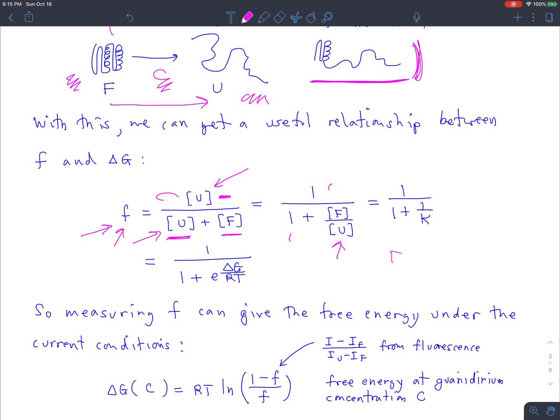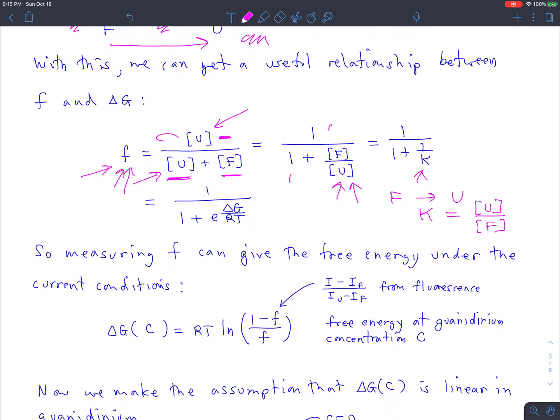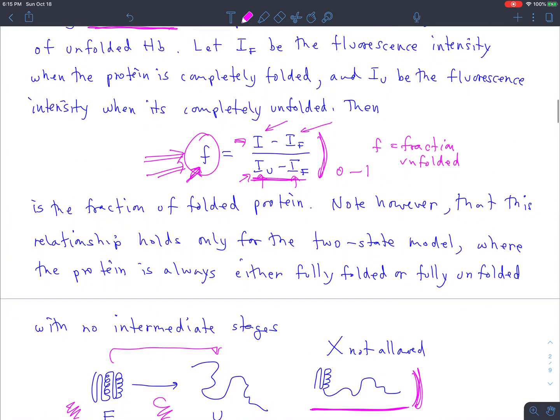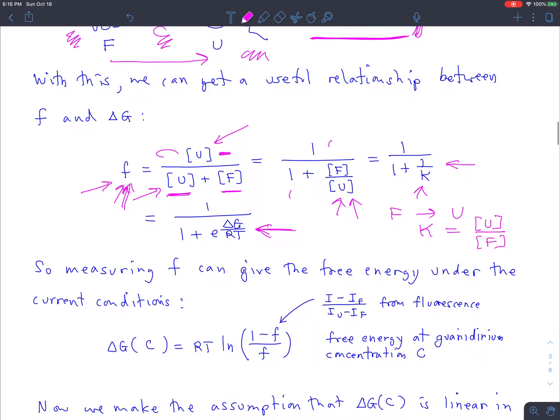But according to our reaction here, F goes to U with an equilibrium constant. That equilibrium constant would be U over F, right? And that means F over U here just has to be 1 over the equilibrium constant. And so the fraction here is related to the equilibrium constant, which is related to the Gibbs free energy. So, and that's of course related to this fluorescence measurement that we're making. So we're going to be basically measuring something that's directly related to the Gibbs free energy change we want when we measure stuff with our fluorimeter.